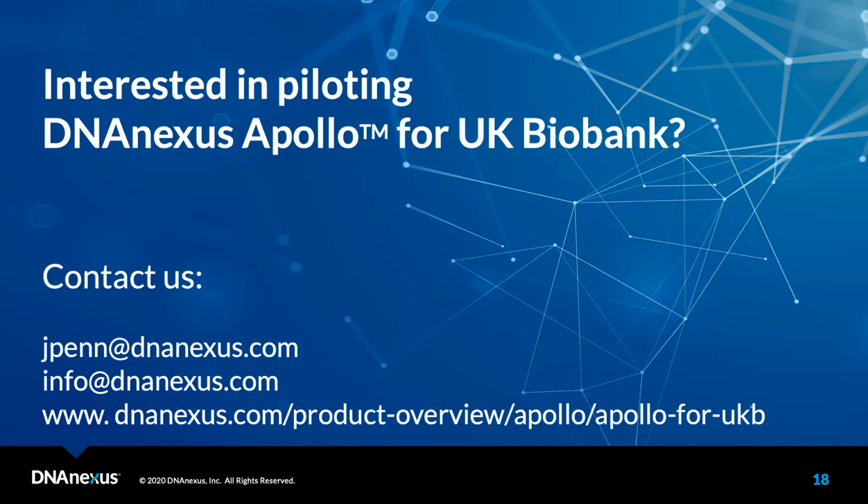All right, great. Can you talk a little bit about the software used to call variants, and what is the depth of the whole exome sequencing? So there are 2 different pipelines that were used to call variants across the UK Biobank data. One was the Genomics PLC WeCall and DNAnexus joint genotype pipeline that was done at the RGC. The other was a functional equivalent pipeline that used the functional equivalence alignment from the paper that came out about 2 years ago now, and did variant calling through GATK, but still had joint genotyping through DNAnexus.